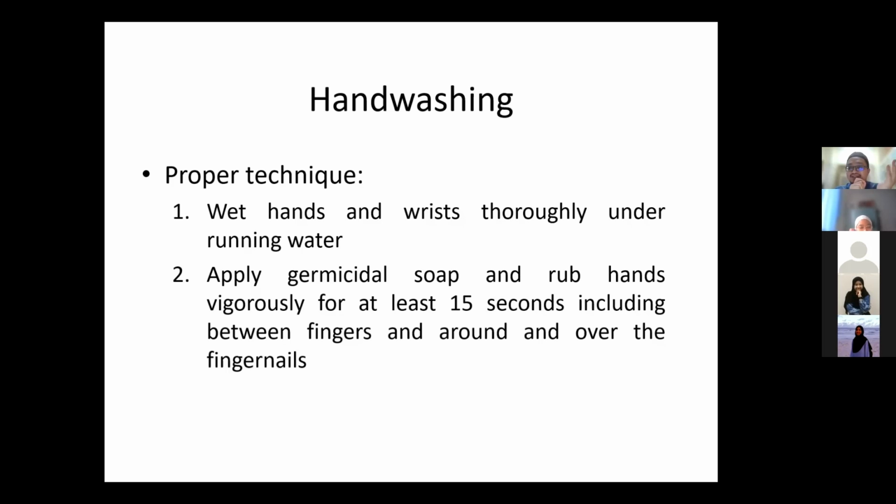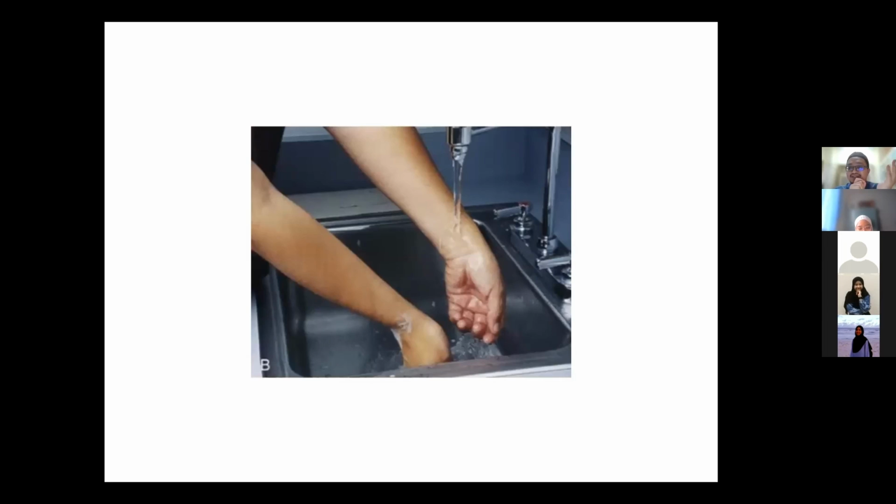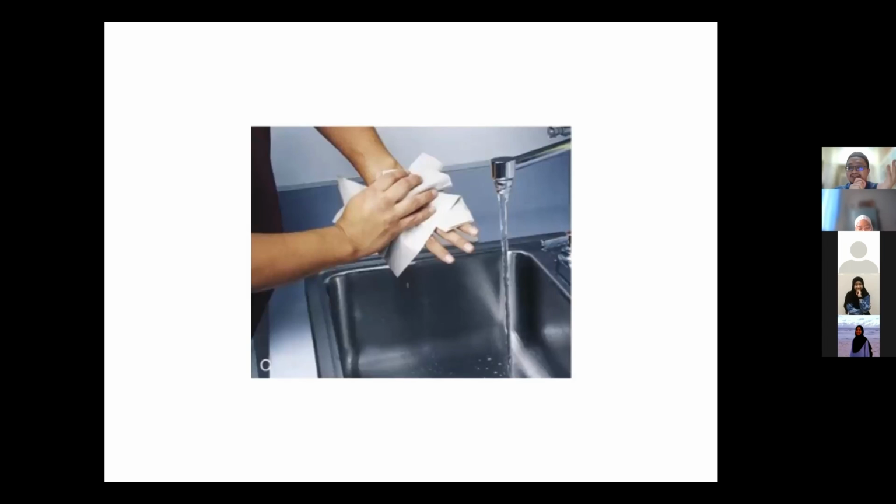This is what happened at the mosque just now. In hospital also, I've seen that happen. People just press once, so it's not enough. So you need to have enough amount and enough time for the hand washing. This is the technique. Yeah, you must first wet your hand and then put the soap. Running water tu enough lah, taklah terlampau besar, tak terlampau kecil. And then rinse. Okay, and then dry using a tissue.